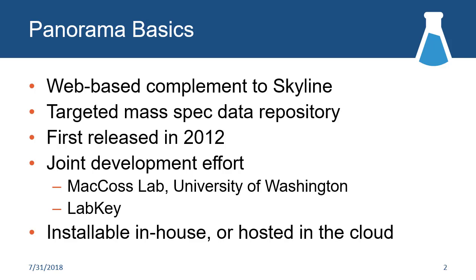And we're always trying to stay current with both Skyline, the main release, and Skyline Daily. So we're generally leapfrogging each other a little bit, trying to make sure that as Skyline adds a new feature, we're supporting that in Panorama and vice versa.